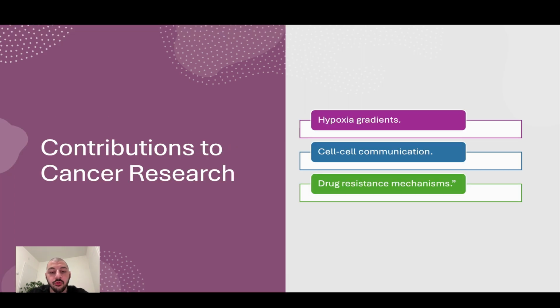Now moving on to contributions to cancer research. Rotary wall vessel bioreactors are also invaluable in cancer research. They enable the creation of tumor spheroids that replicate key features of solid tumors, such as hypoxia gradients, cell-cell communication, and drug resistance mechanisms. These tumor spheroids are ideal for testing anti-cancer drugs as they better reflect in vivo drug penetration and response compared to traditional 2D models.